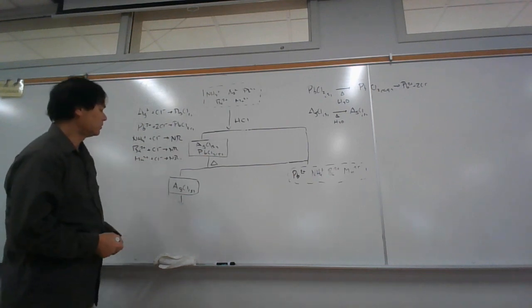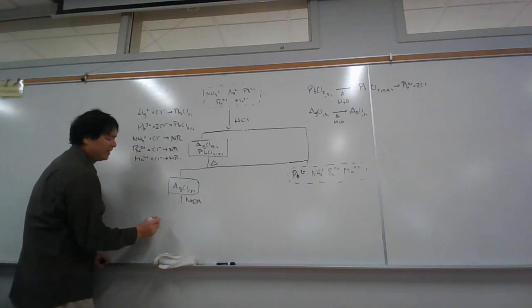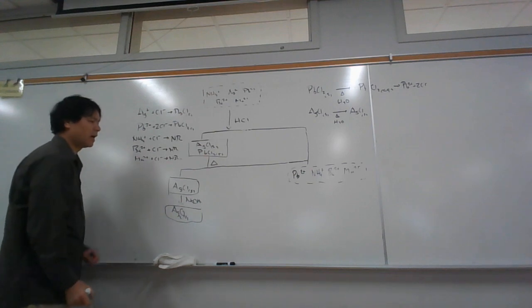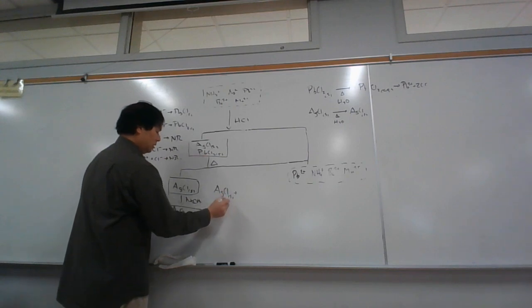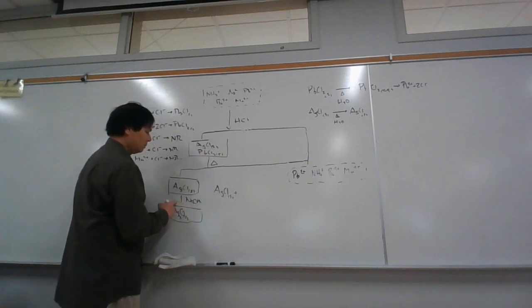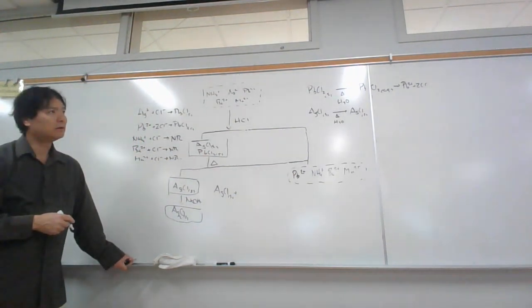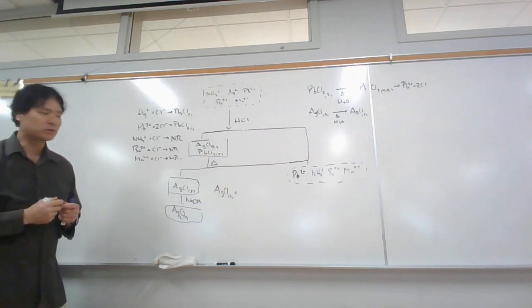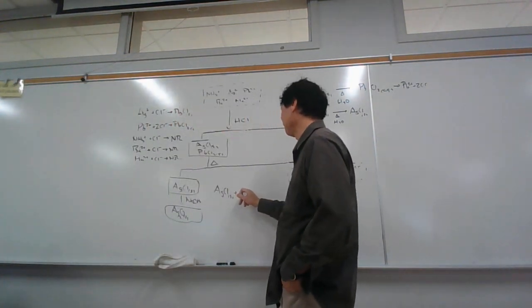Okay, then we're going to treat our silver chloride solid with sodium hydroxide. Just dump it in there. And in this case, we're going to go to the silver oxide solid. This is black. And so the precipitate turns black. And so in this particular reaction, we're going to have silver chloride solid. Oh, actually, do we dissolve it? No, I don't think we dissolve it. In the flow chart, you just add the sodium hydroxide straight onto the solid precipitate. We could dissolve that precipitate, but we aren't at this point.